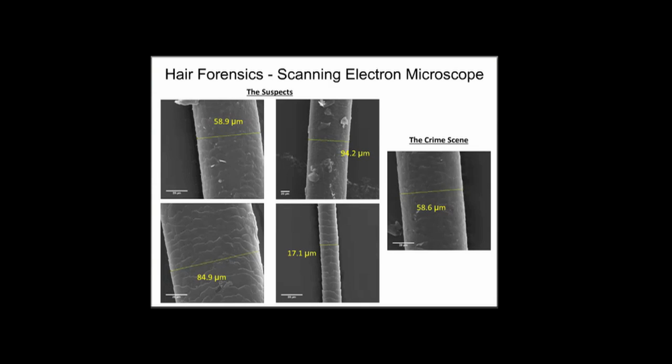And so we had the students, or one student for each sample. We actually had a couple more samples, and they would drive the instrument. And then the students would make notes about it. They would measure it across like you see now and notate any differences from sample to sample, and then look at the crime scene sample and see if they could match it up with the different suspects.